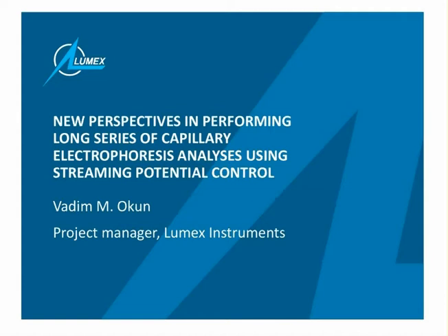So you know that CE was born about 30 years ago. CE is an abbreviation of capillary electrophoresis. Since then, it has developed and gained huge popularity as a separation technique. And now it is used in a variety of different fields of analysis, from biotech research and university research up to routine analysis for wine, beverages, water analysis, soil analysis, any kind of environmental analysis, chemical analysis, and so on.